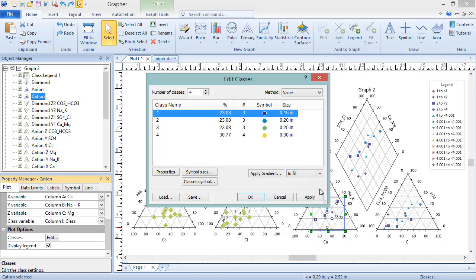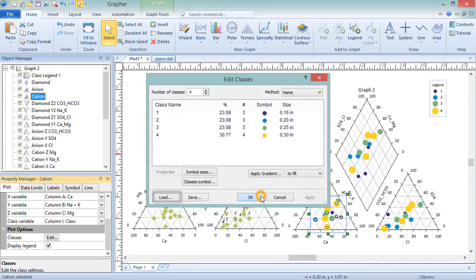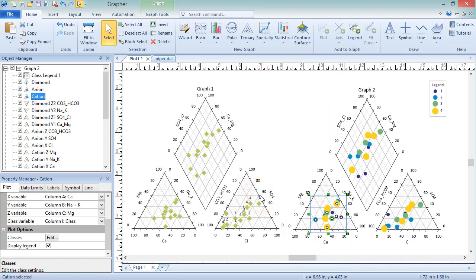Classes can be saved by clicking the Save button, and GCL class files can be loaded by clicking the Load button. For Piper plots, one common use of classes is to designate where the samples were collected.